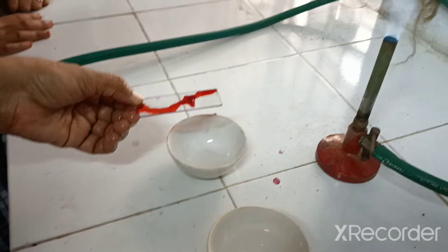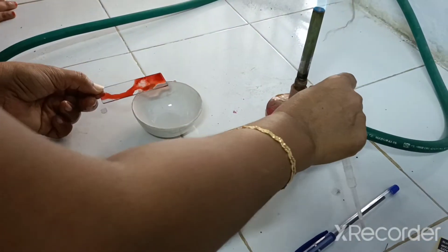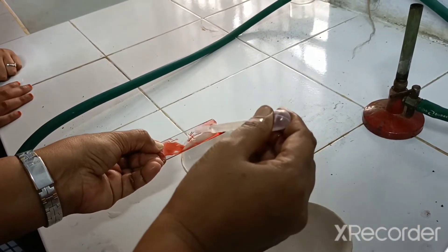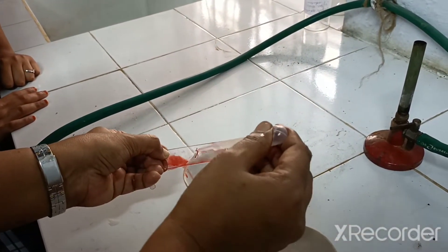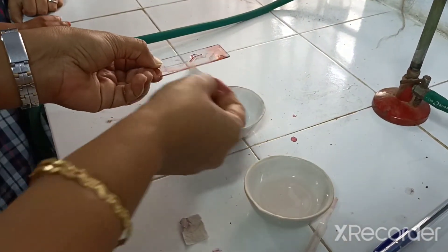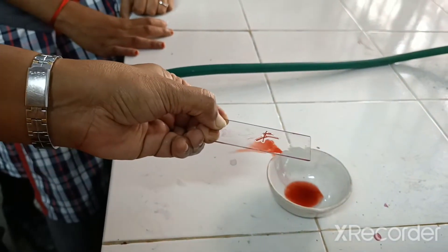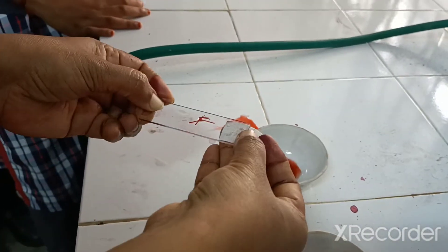Now the excess acetocarmine needs to be removed. Can you see it has been stained properly — it has become darker in color. Remove all excess acetocarmine with the help of water, then wipe the slide. You can see some red spots that need to be wiped up. The slide must be clean before putting on the glycerin.